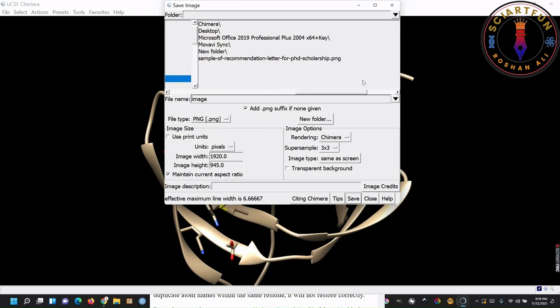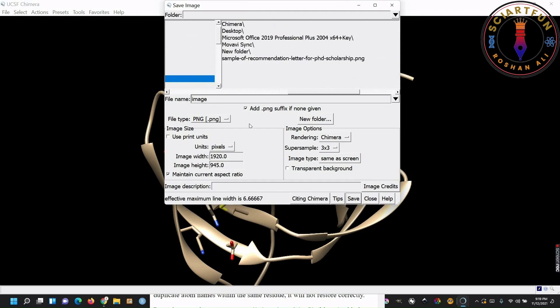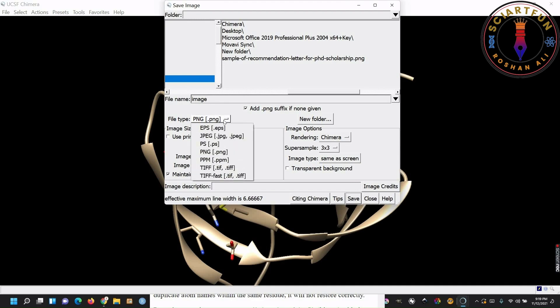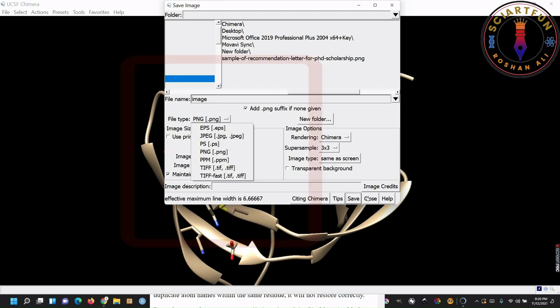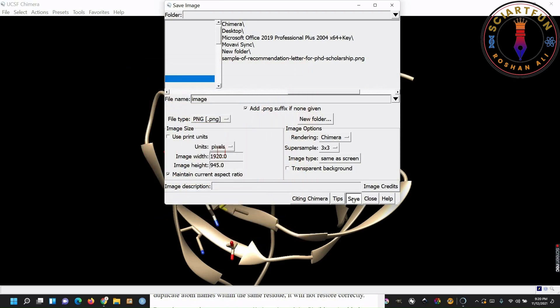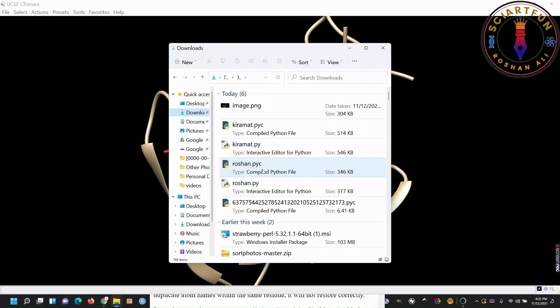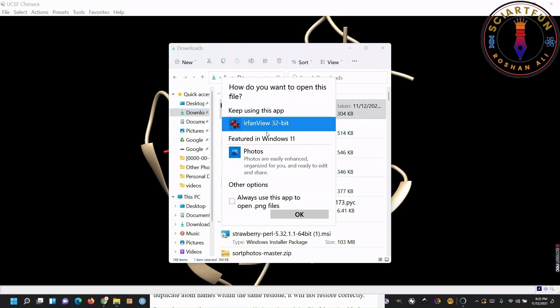Select the location where you want to save your image. Type the name of the image. Then select the format and click save. Your image is saved now. Now let's open the saved image. Just go to the location and open the image in your desired image viewer.